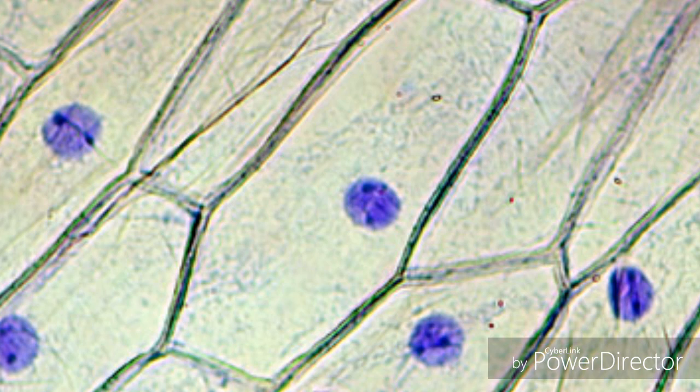So we are able to see the nucleus clearly. But mitochondria, we are not able to see clearly. Here and there, red colored small dots are seen, that's all. But the nucleus, we are able to see very clearly. A big spherical body is seen in all the onion peel cells.